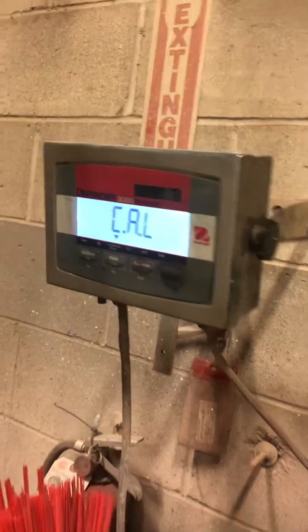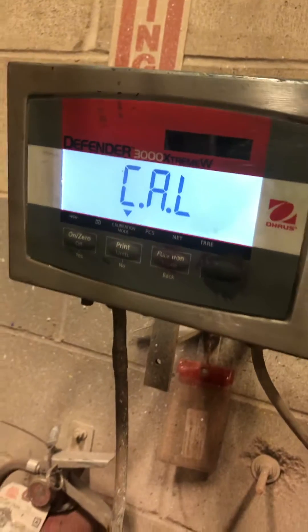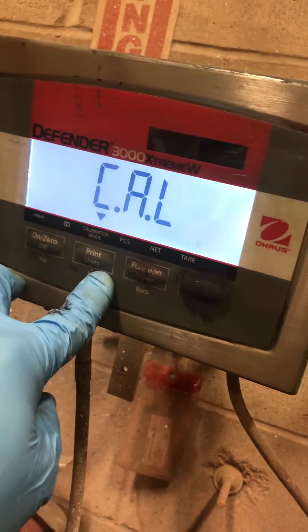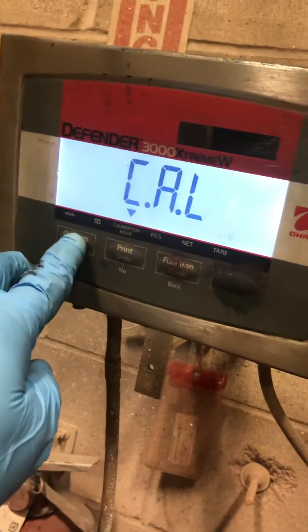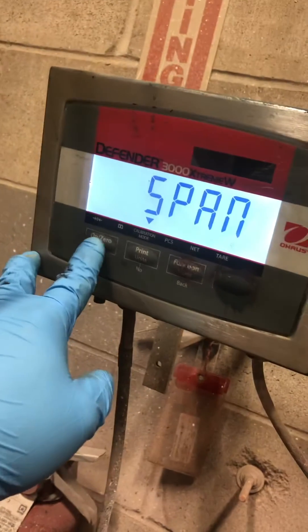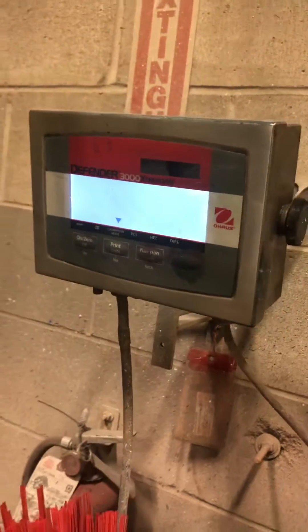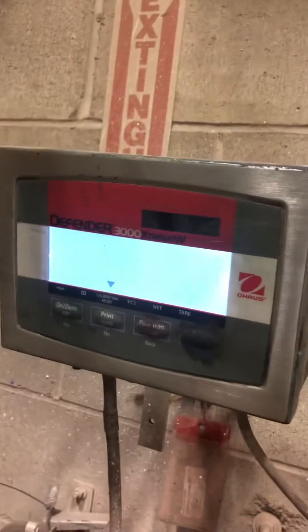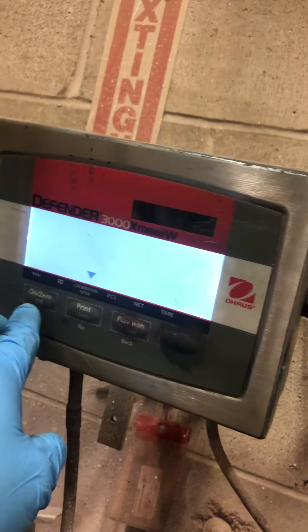Once you let it go, 'CAL' comes up. You got the keys to see yes and no. You want 'CAL', so you hit yes. It goes to span. You hit yes. It does a zero adjustment first — obviously no weights on the scale. You do a zero adjustment. You hit yes.